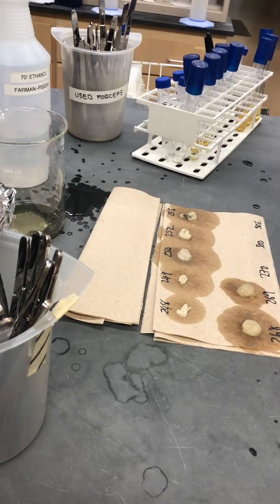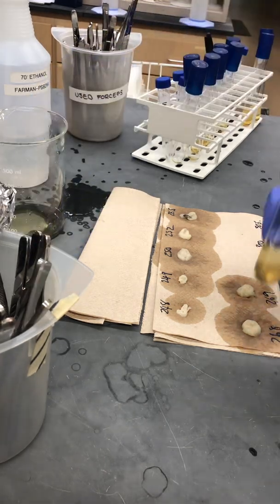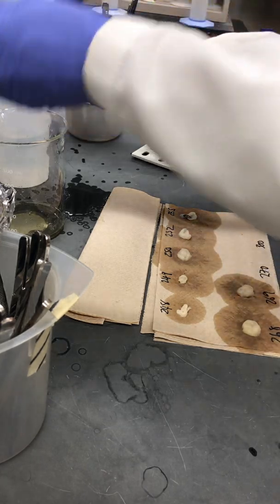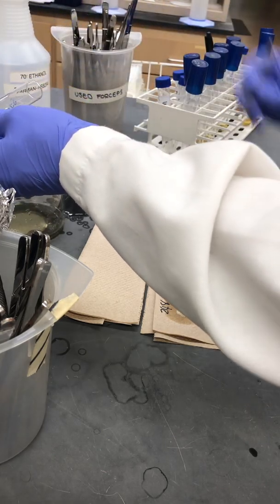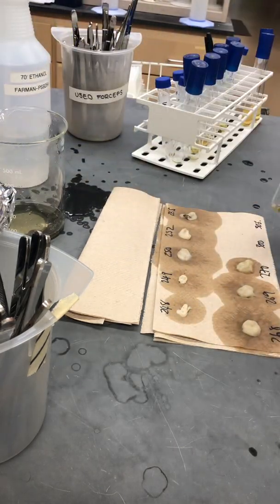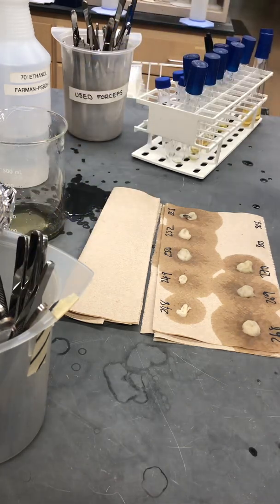Typically one of these mycelial balls will yield three or four micrograms of DNA, which is plenty for just about any processing we're going to do later on. We can do hundreds, maybe thousands of PCRs, generate libraries for Illumina sequencing or Nanopore sequencing. We get a lot of DNA, and very rarely do we have to resort to doing large-scale DNA extraction.